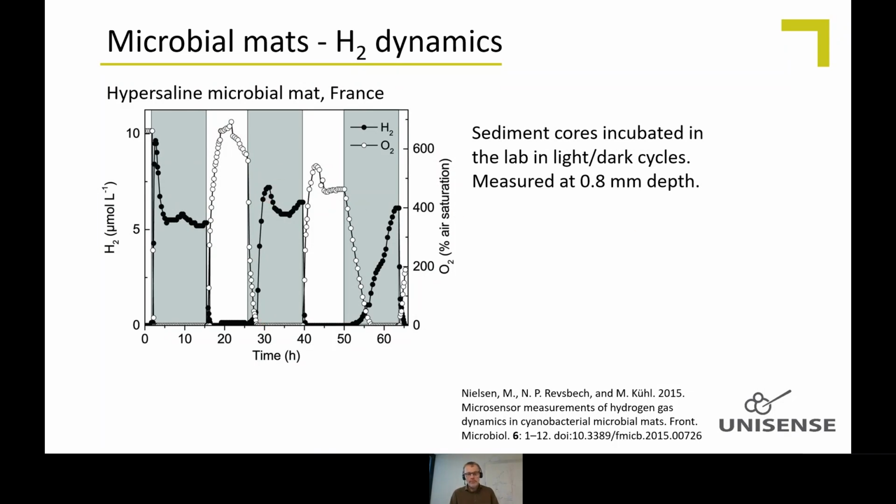So this is also what sensors can be used for, and this relates to the question from the last presentation. I was actually surprised to see there's so much hydrogen appearing here, and that is of course a problem to the standard H2S sensor, which is the one that's sensitive to hydrogen.